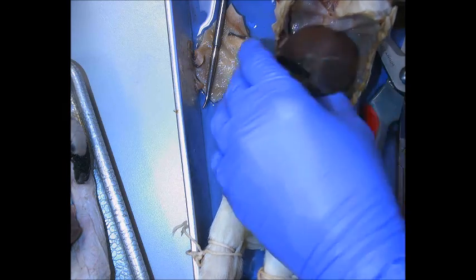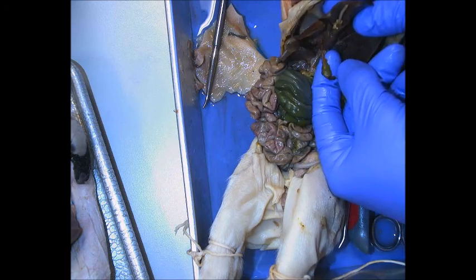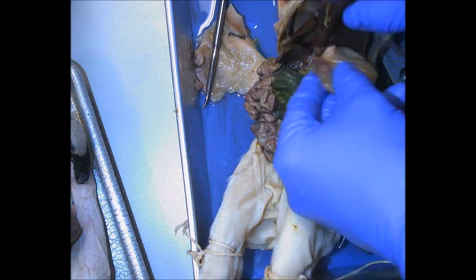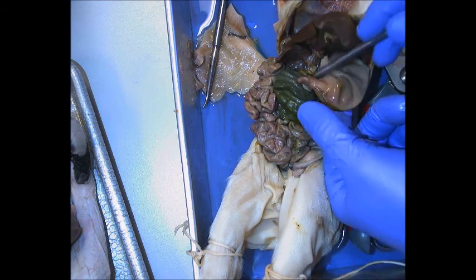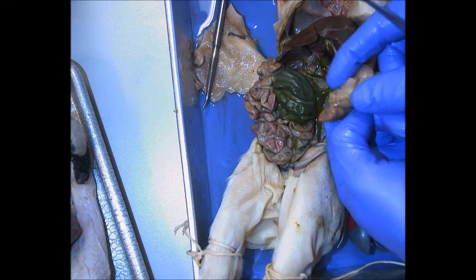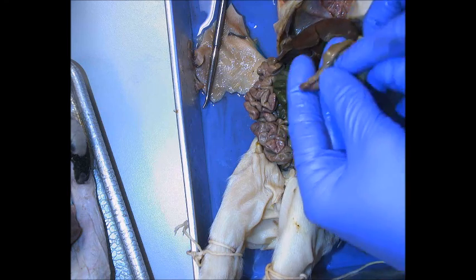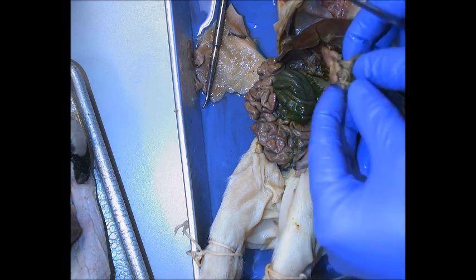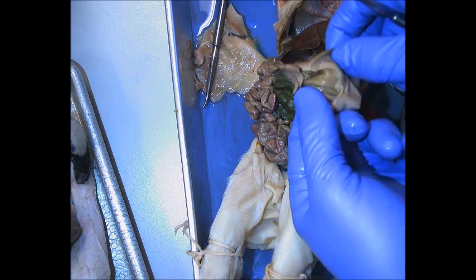Continuing on down, we run across the liver. Lift that up and you see the gallbladder. The stomach has already been removed — it would be right up in here, with the greater curvature down here and the lesser curvature on the inside. The esophagus would enter here. It's thick down here — this is where the pyloric sphincter is found, in the pyloric region. The folds inside the stomach would be the rugae.